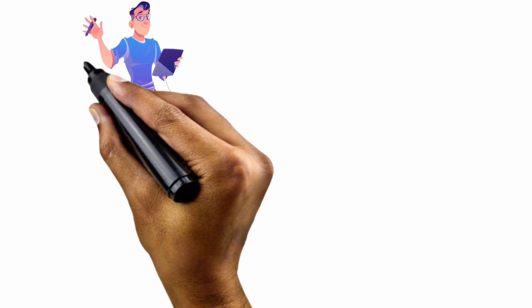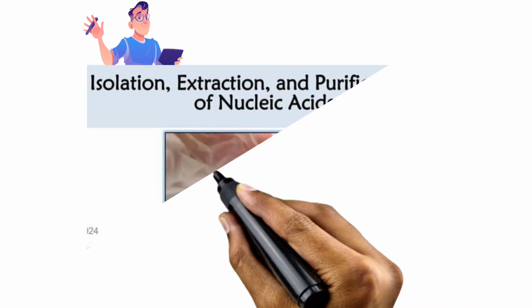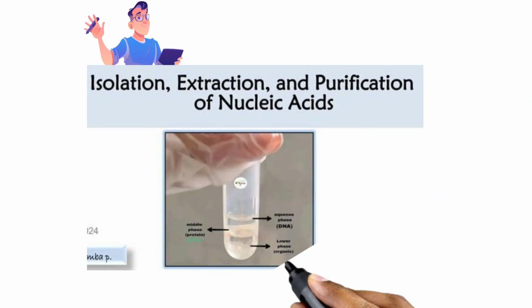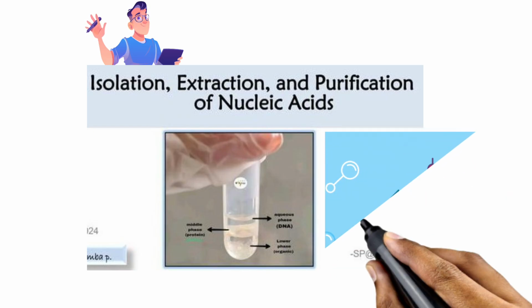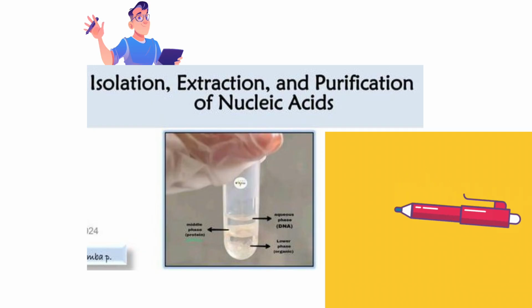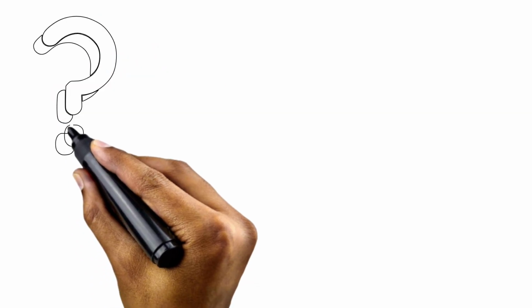So now in this video lecture we will study the extraction of nucleic acids, isolation and extraction of nucleic acid purifications. Now what is the purpose of doing this nucleic acid purification? Why do we do nucleic acid purification?